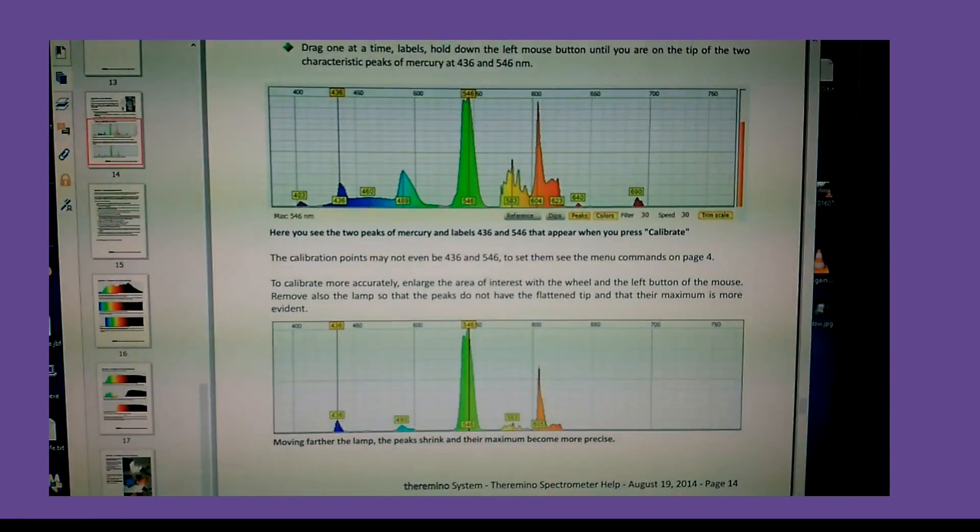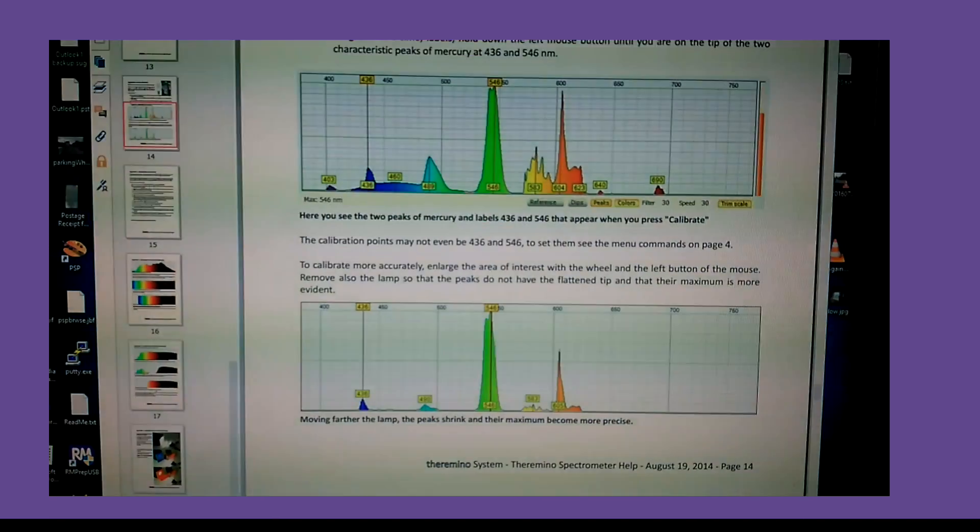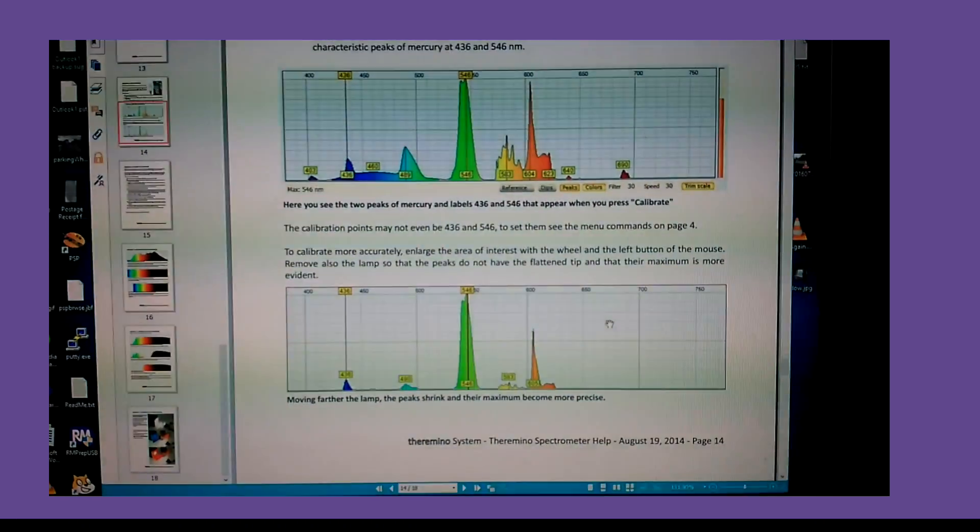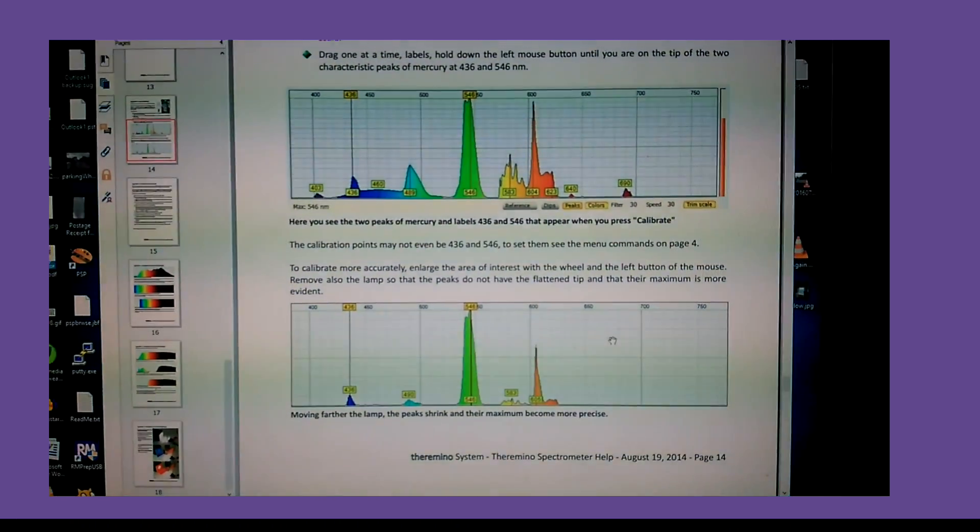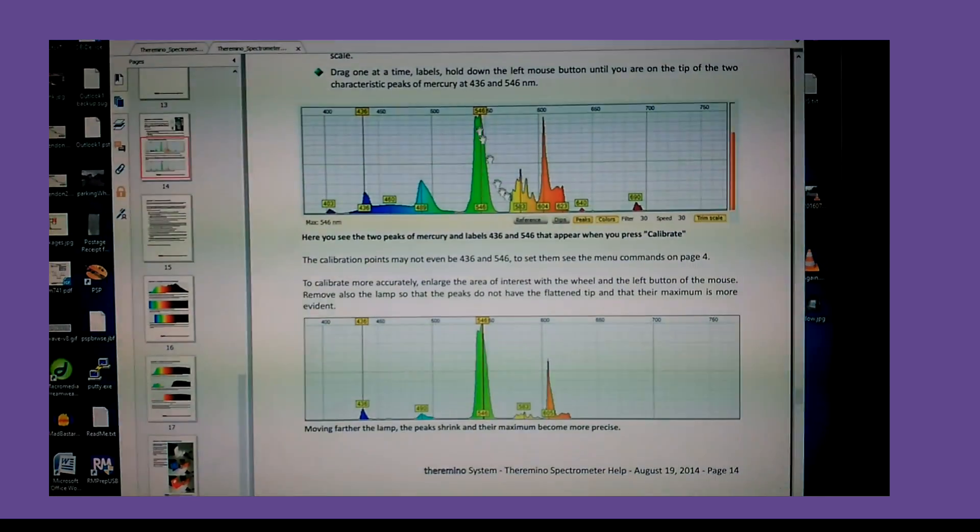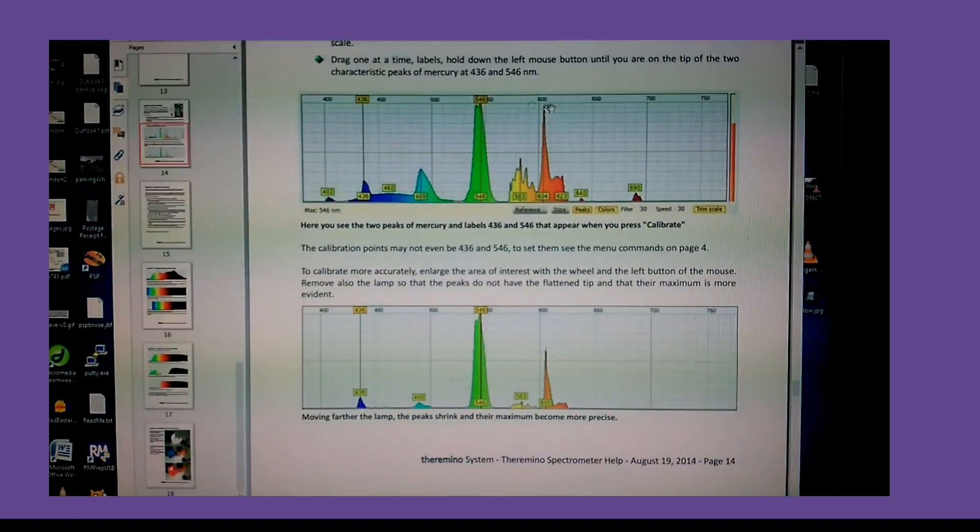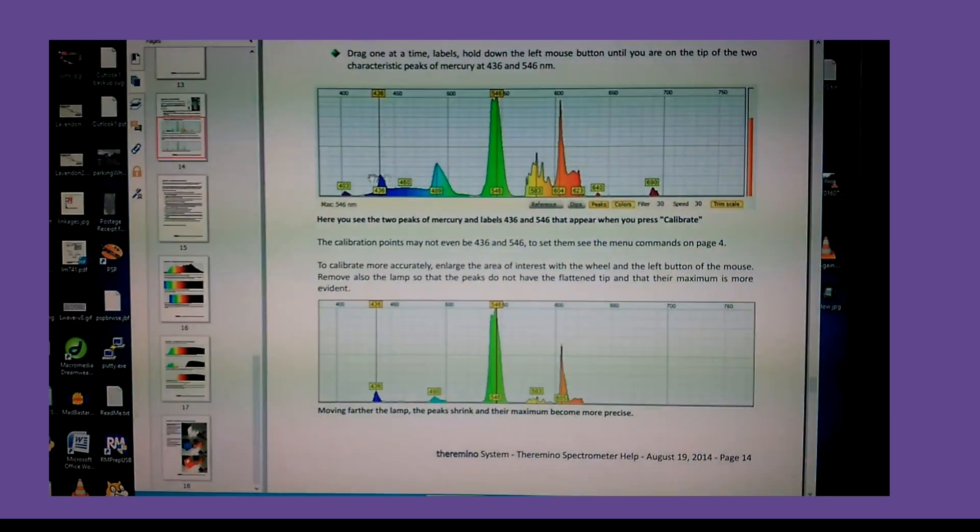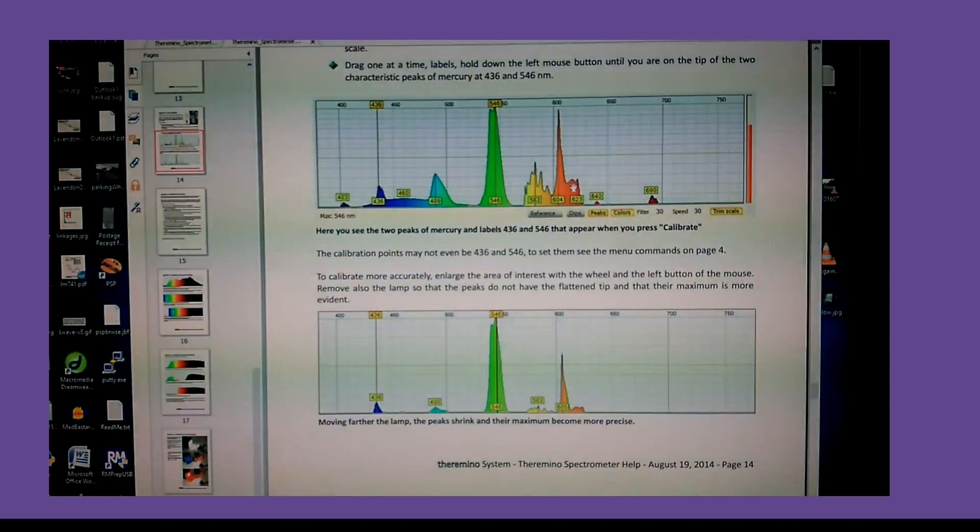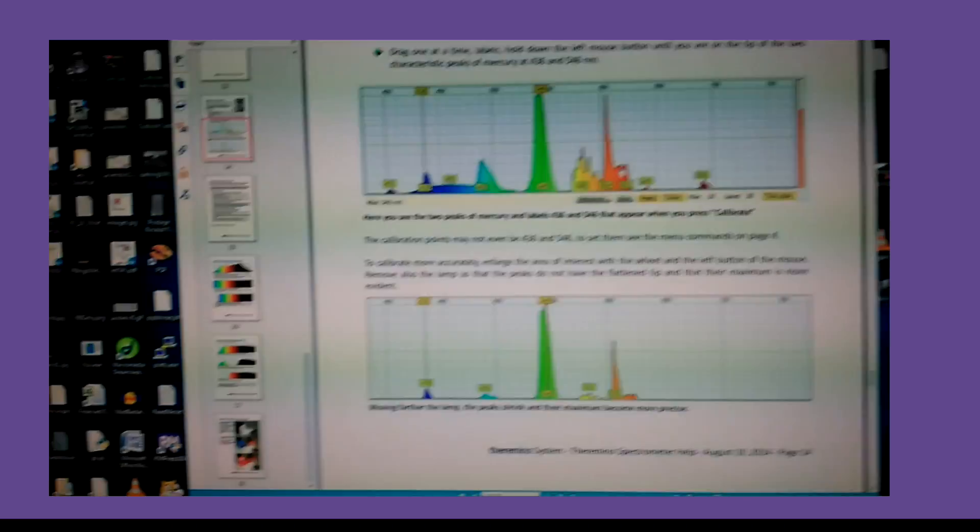Here's a web page with two possible spectra from fluorescent lights. And you can use these characteristic peaks to calibrate the device. So that's what I'm going to do now.